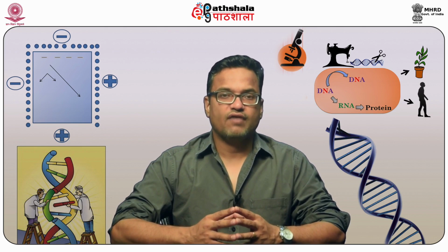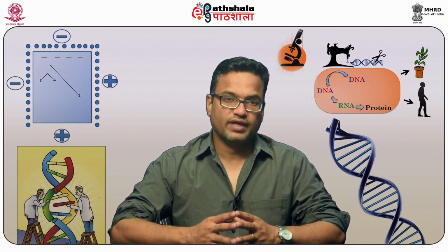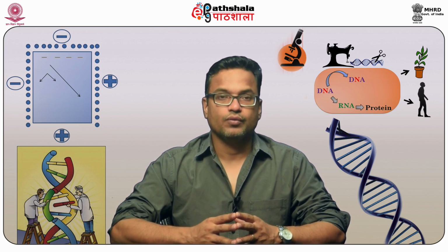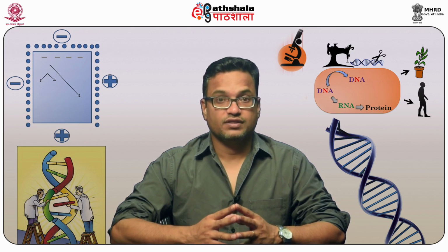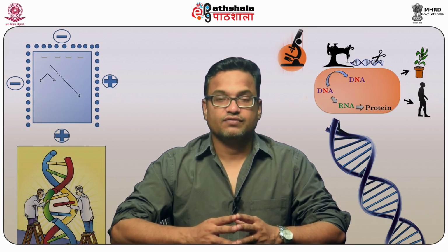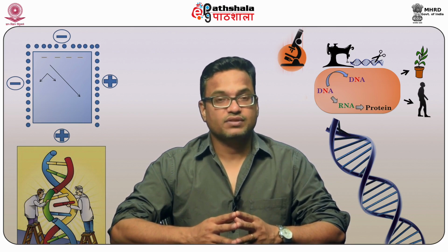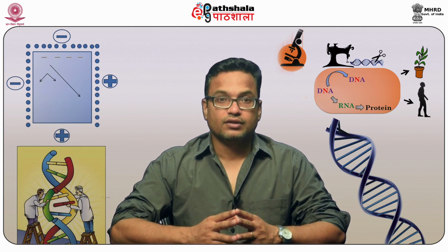So now we have named the sites in the insert as well as in the vector as att1 and att2, which allows specificity in terms of direction as well as location. So what happens in this case, for example, an attB1 site recombines with an attP1 site, and an attB2 site recombines with an attP2 site.